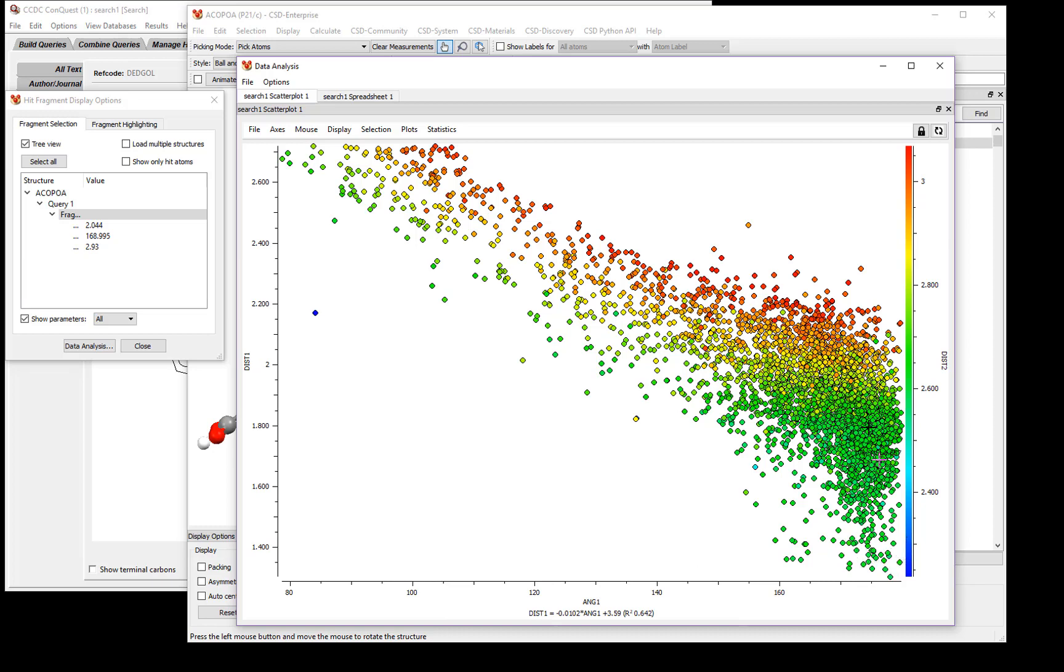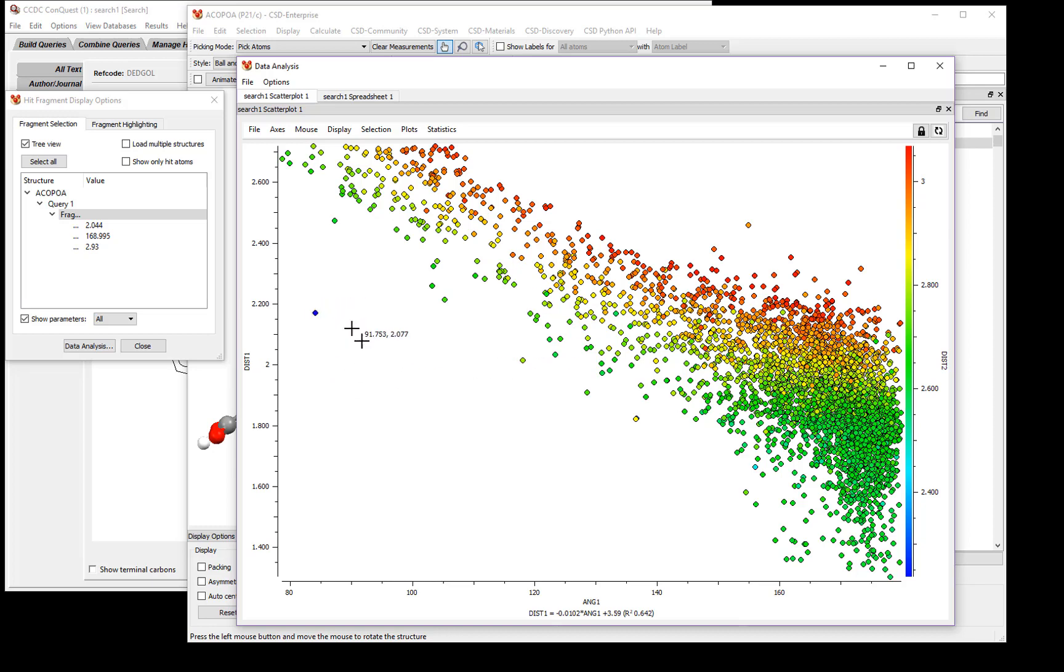You'll notice that we have a few outliers in our spreadsheet. For instance, this point here is well outside the trending data, and also it's blue, so the color does not match what we would expect for Distance 2. To investigate this structure, we can click on this point. You'll see now that the point is highlighted, and the ref code is given, and all of the other data is grayed out.